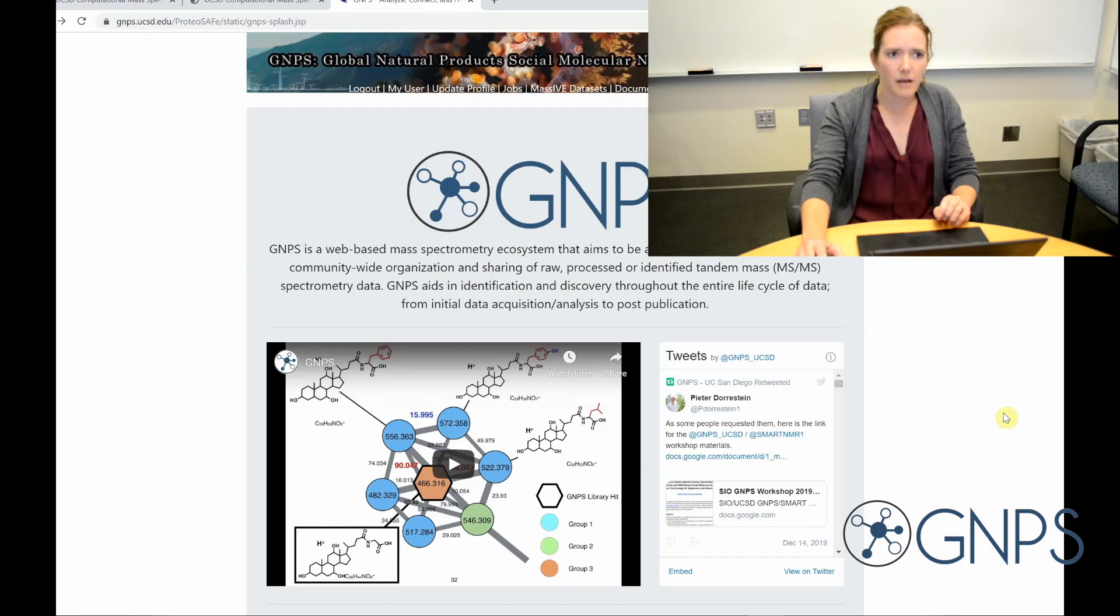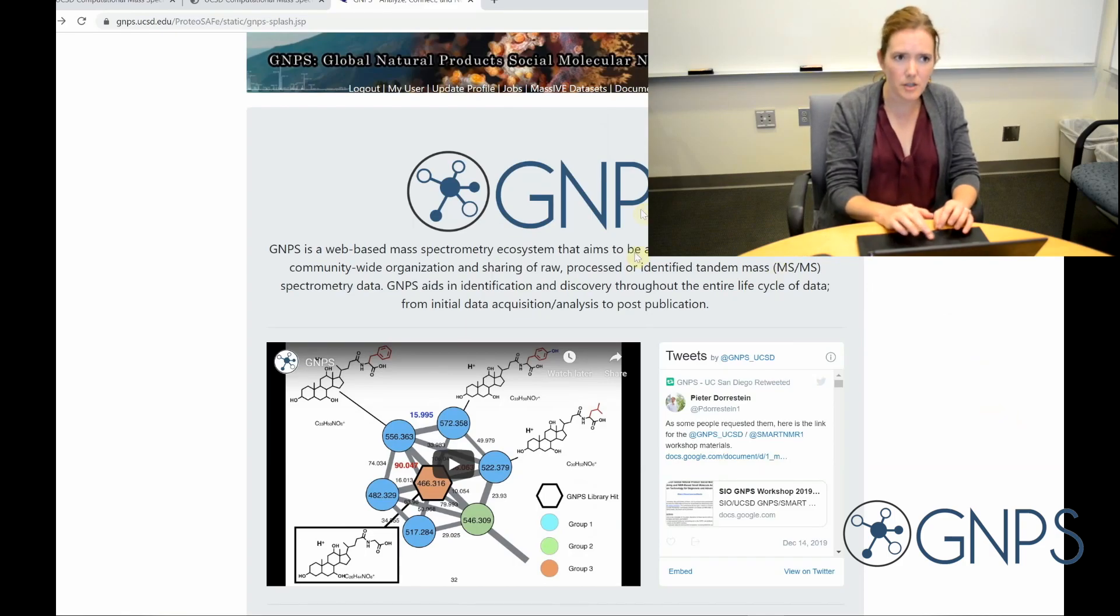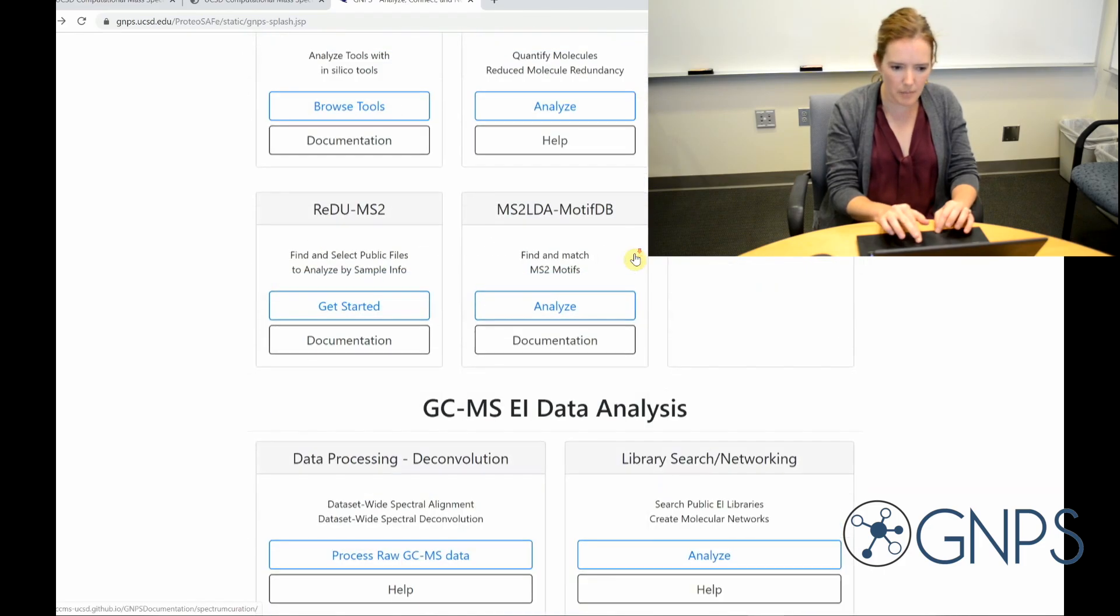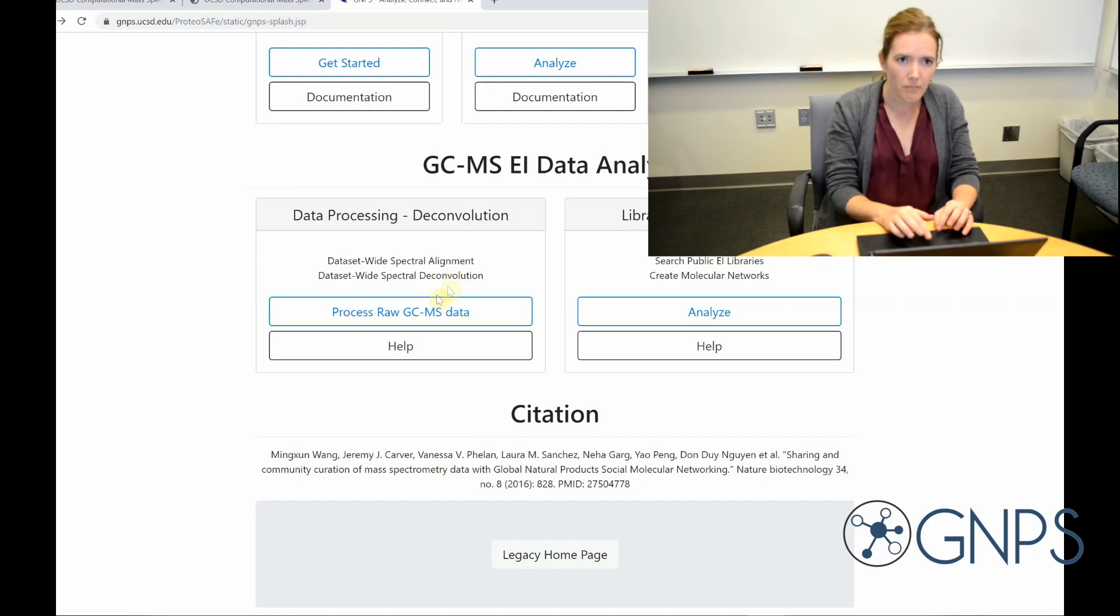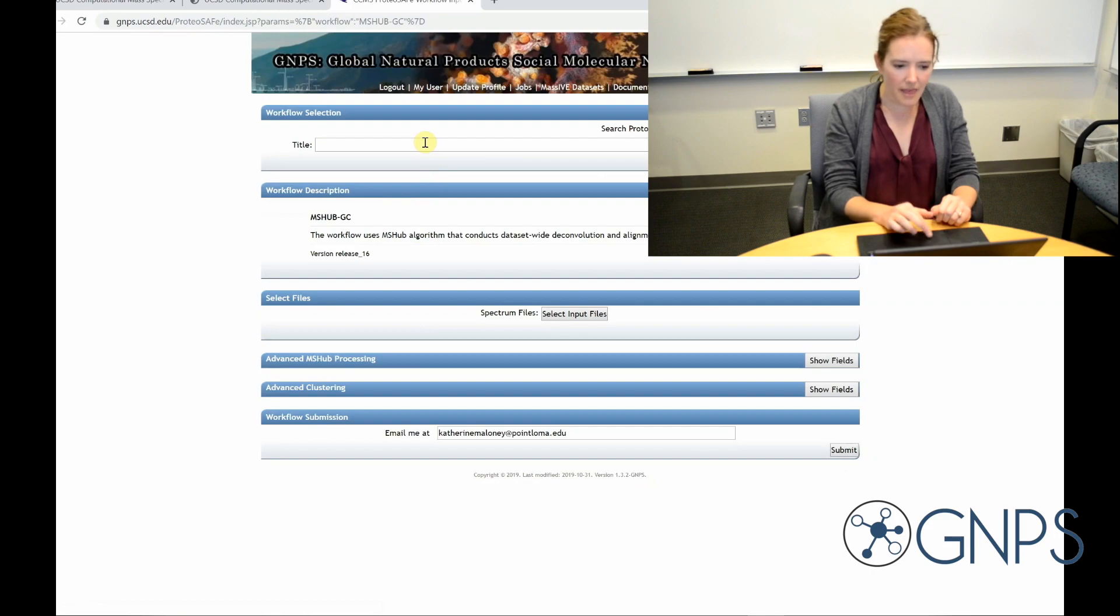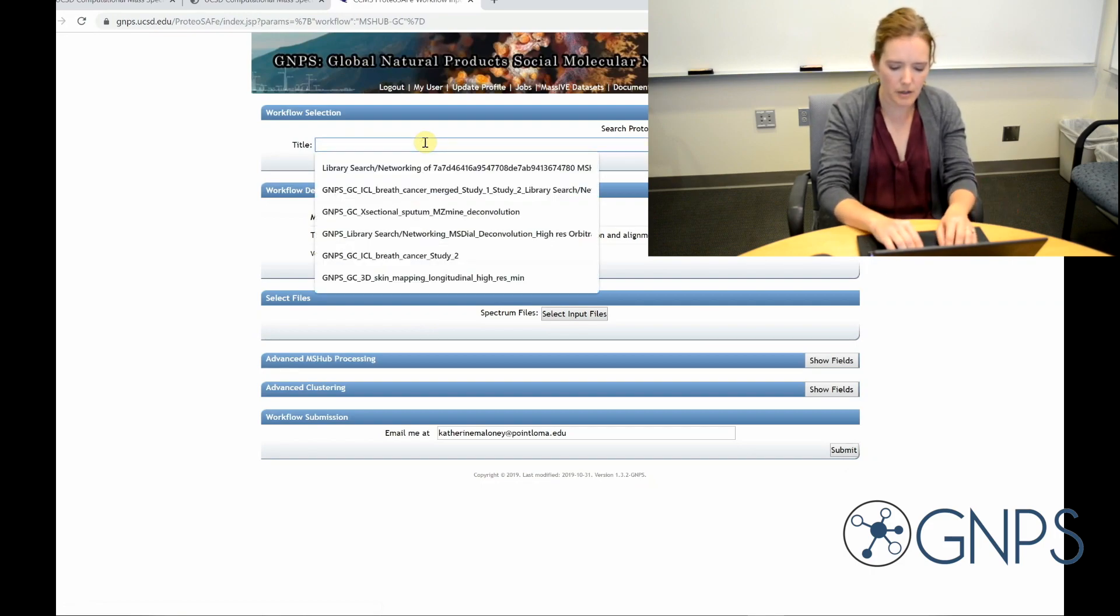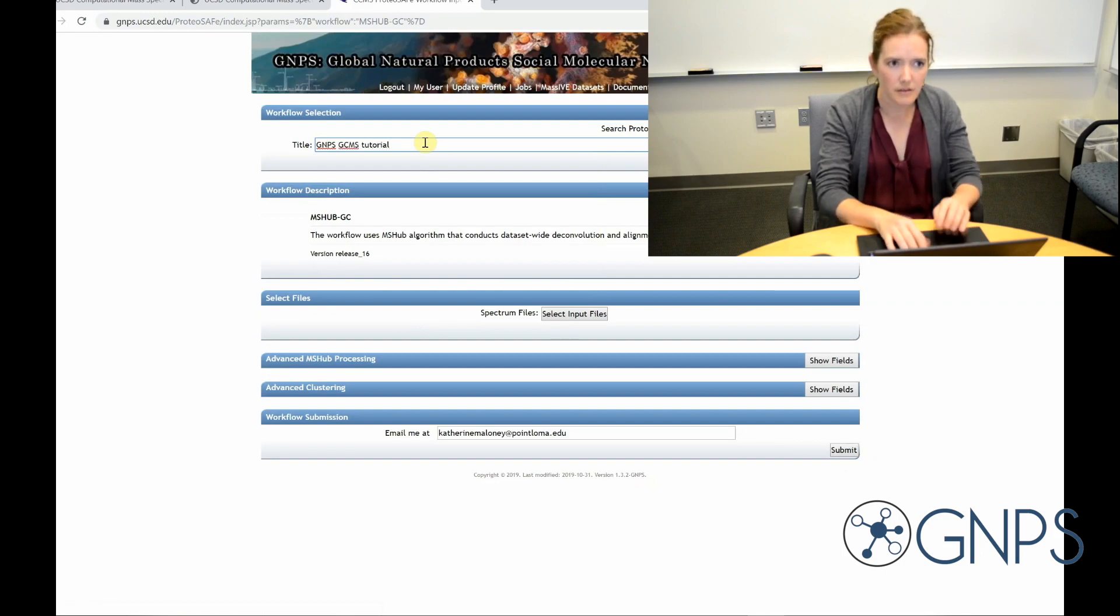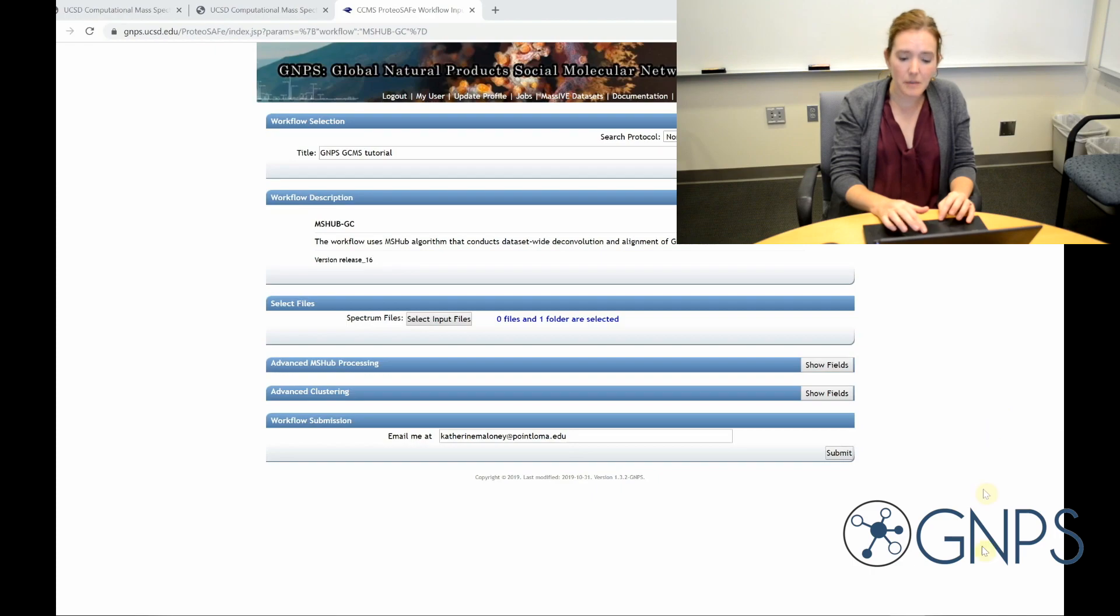But for the purpose of this tutorial, I'm going to use a data set that's already been uploaded to Massive. So from the GNPS home page, I'm back here now, I'm going to scroll down to the GCMS data analysis. I'm going to click on process raw GCMS data. And then here, I'm going to give my job a name. So I'm going to go with GNPS GCMS tutorial. Okay, so next, I'm going to click on select input files.